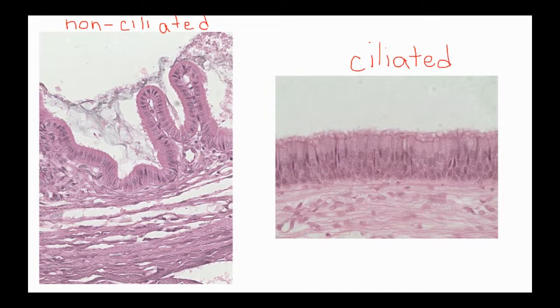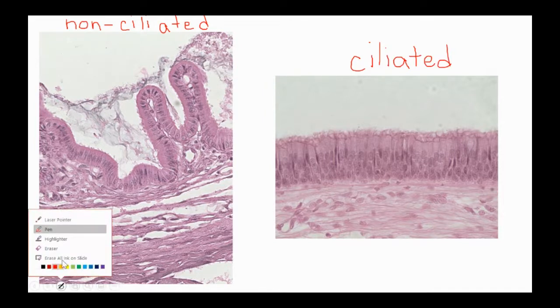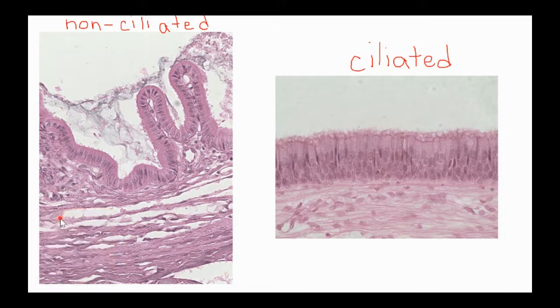Let's start first by talking about how you're going to identify if we are ciliated or non-ciliated. Check out this tissue over here. And yes, Elipine is correct. This one over here is pseudostratified. Yeah, fake it till you make it. Over here on the right, this hot mess over here.